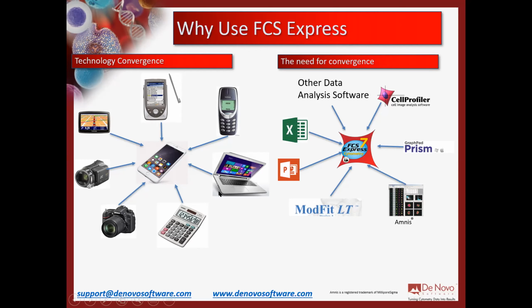And really all of that is wrapped up into your smartphone now, and that makes life really convenient. You don't have to carry around all these different devices to do what you do in your daily life. And the same kind of thing can be said about working with flow and image cytometry data analysis.